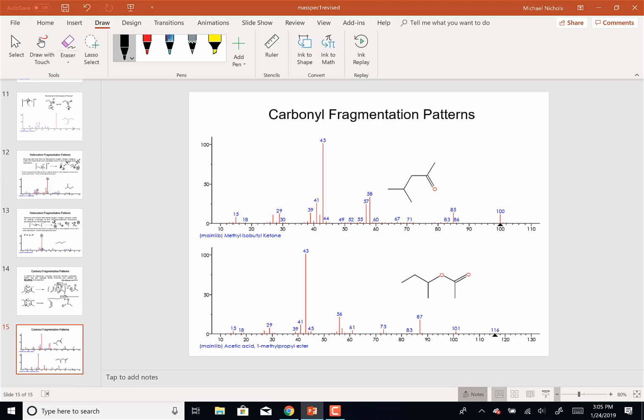So if anybody was like, well, I don't really think that's the peak, I don't know if anybody's done that, but you could actually go in and verify it, or at least come up with the fragmentation patterns you expect. I don't know how many people have done that. We were looking at one molecule. That's the breathalyzer.